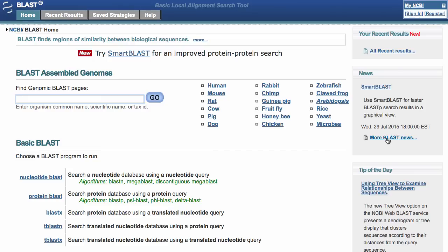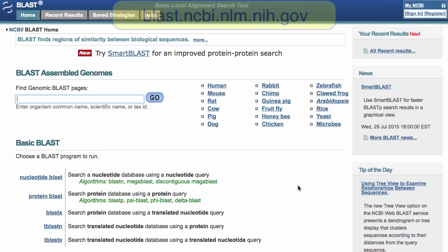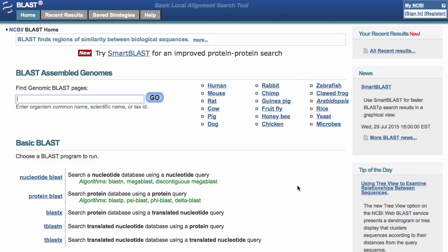I'm going to start with blasting into genomic datasets at the NCBI website. I assume that most people are familiar with the BLAST website, but it's okay if you're not — you can learn on the job. First, I'm going to point my browser at blast.ncbi.nlm.nih.gov, and you'll get the page you see right on your screen here.